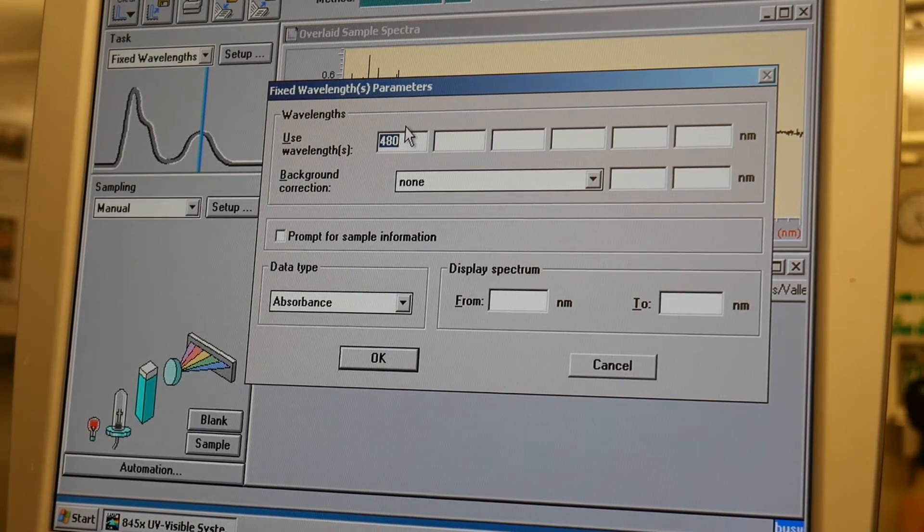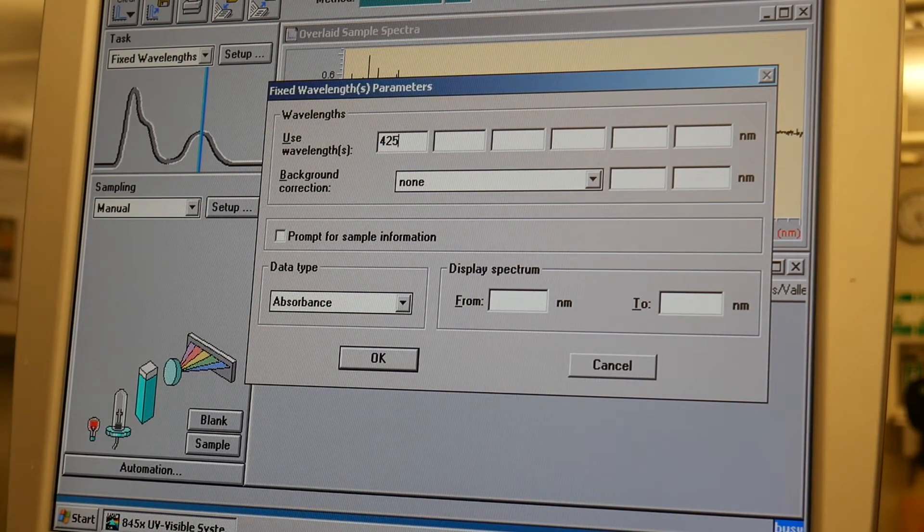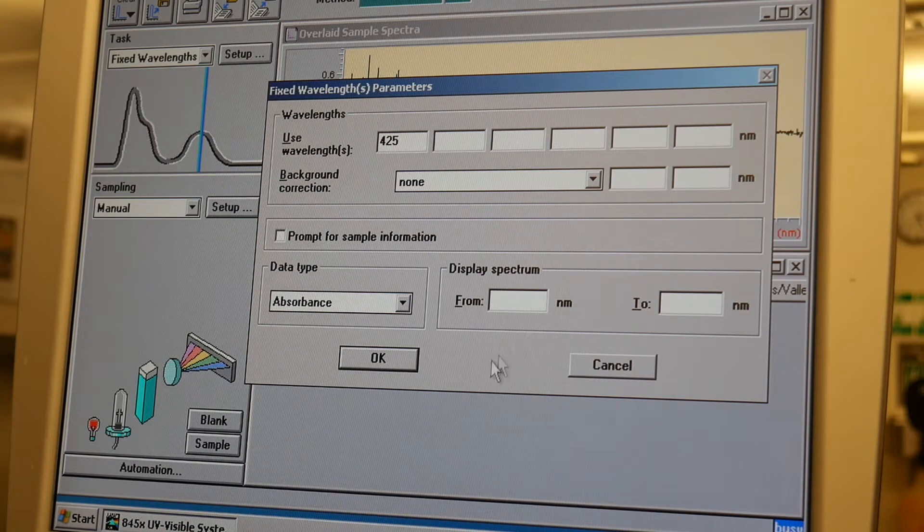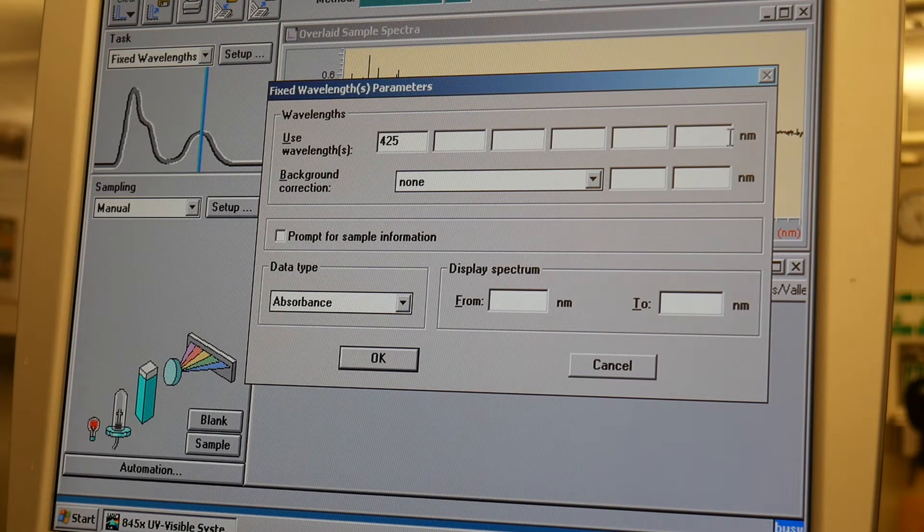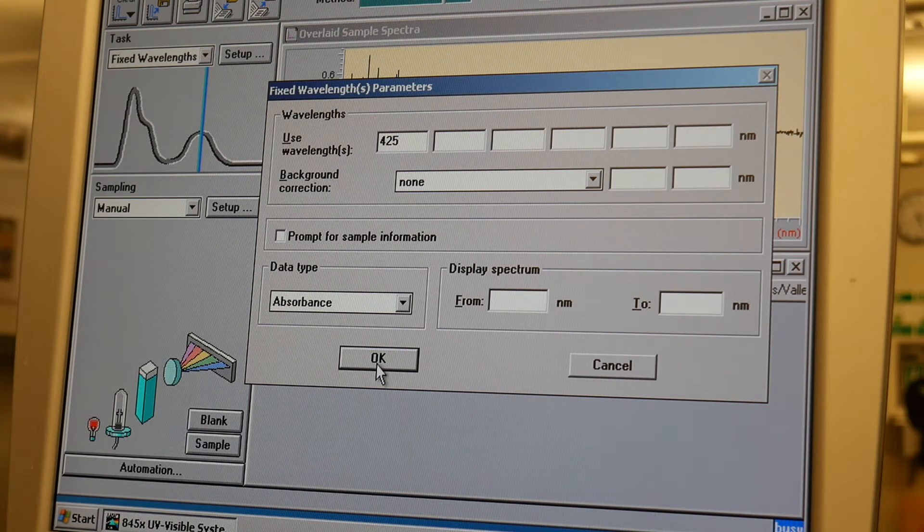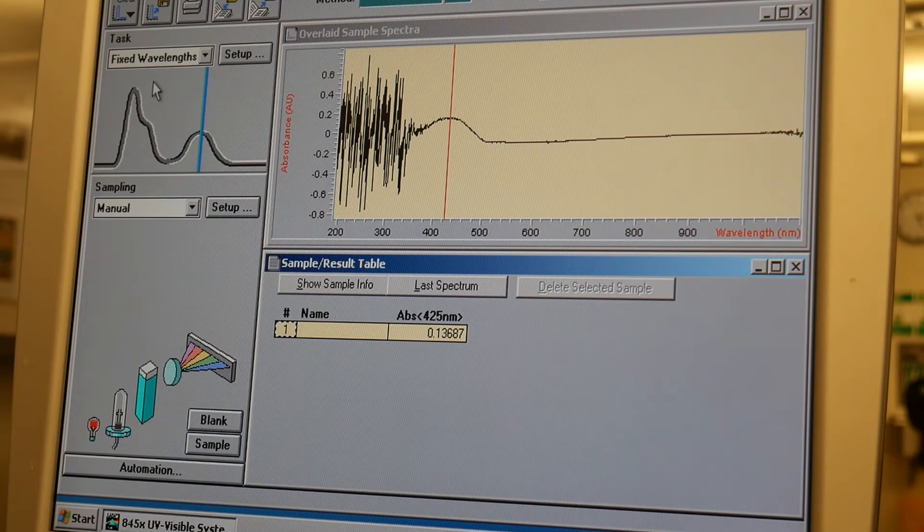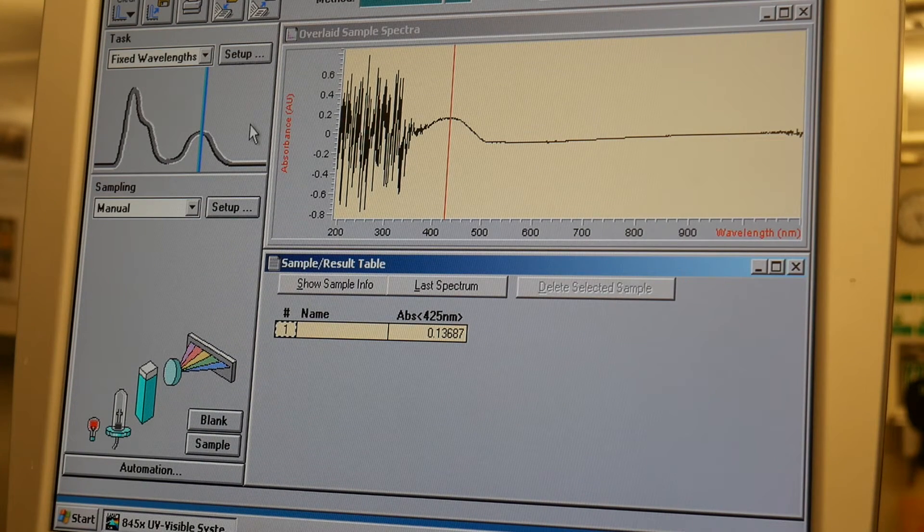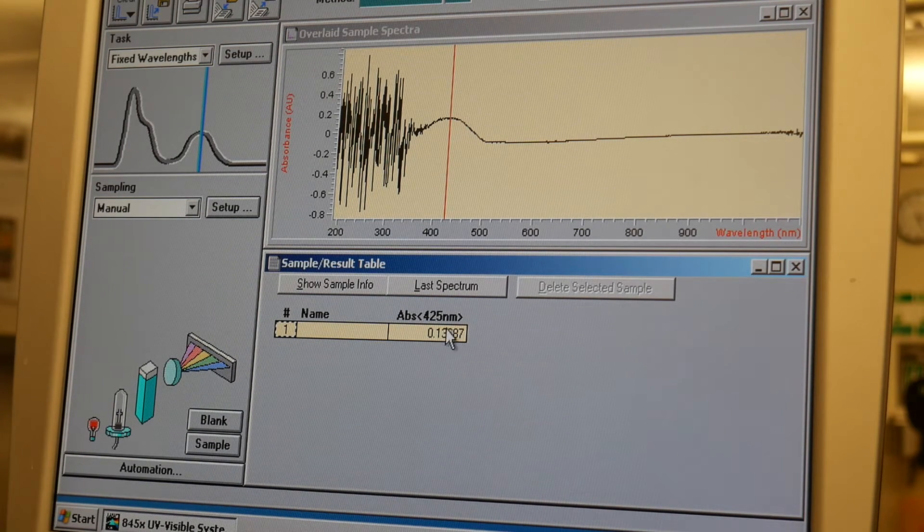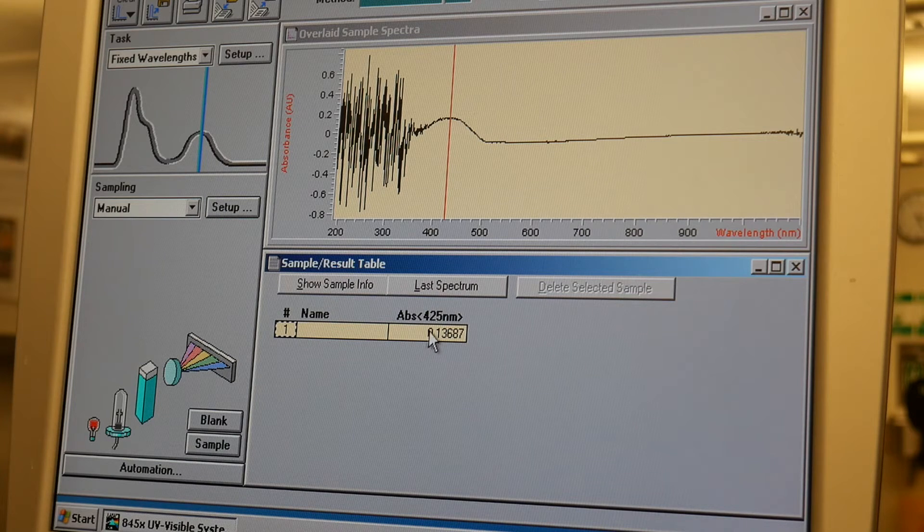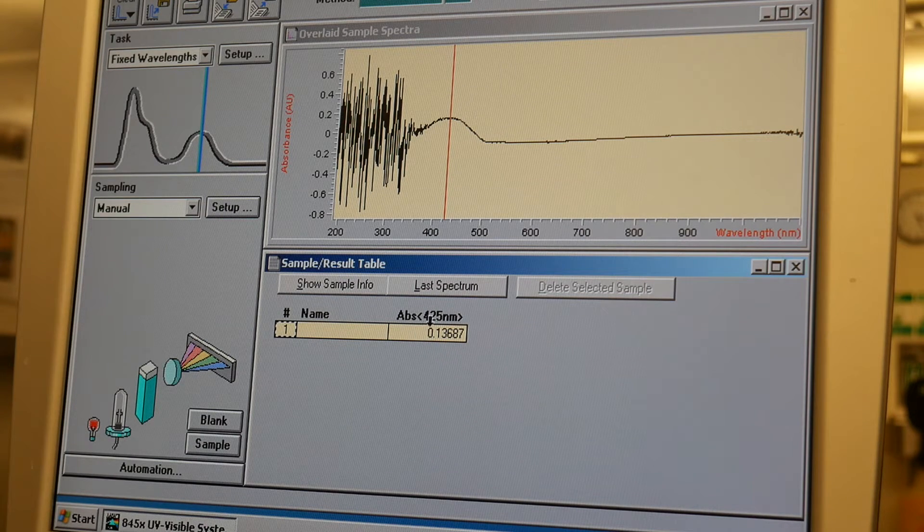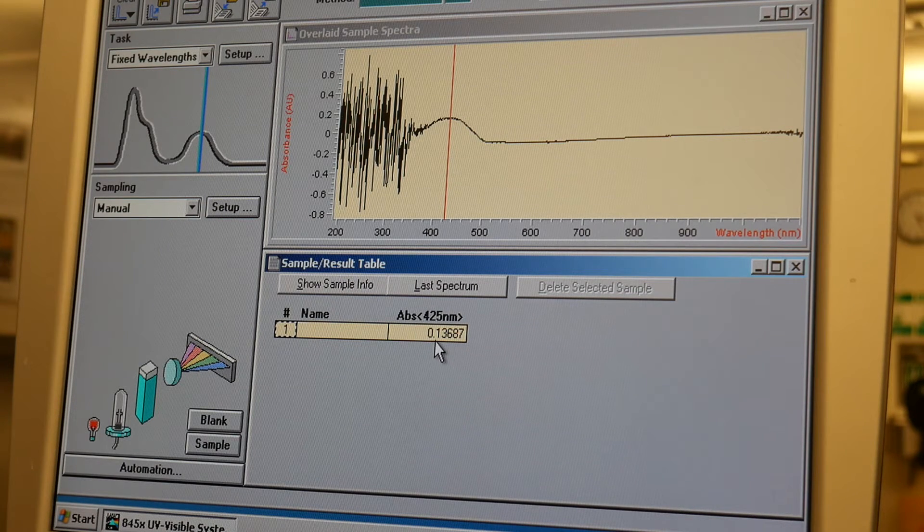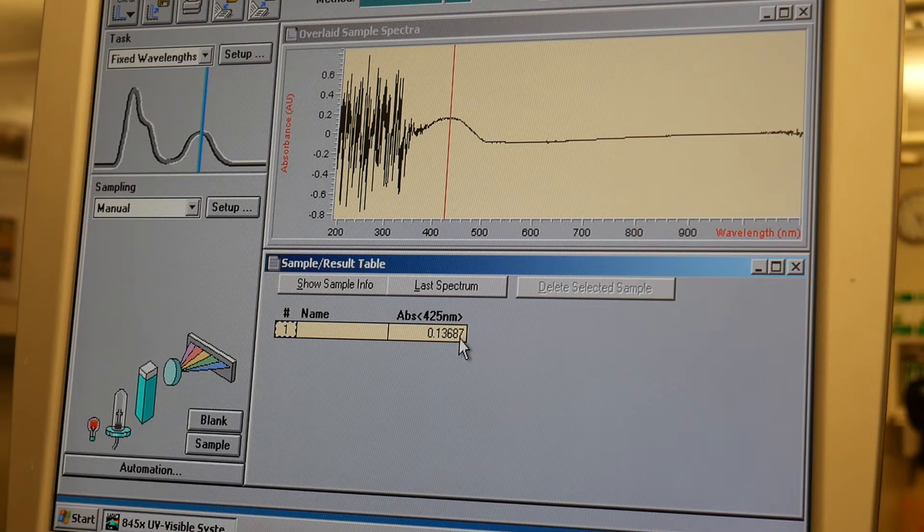What wavelengths do I want to look at? Well, how about 425? So you can see there's room to put up to six wavelengths. So I'm going to click on that. And you can see now it's showing us the absorbance at 425 nanometers is 0.13687.